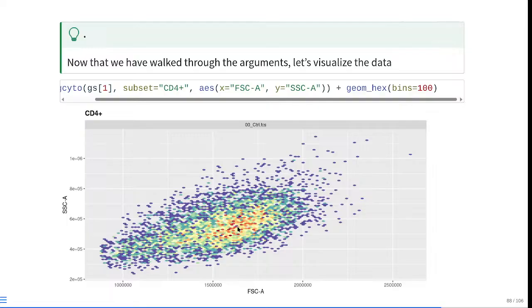And this will also impact the pseudo-color appearance of the heat map values that you see present in the plot. So this is something you can play around with until you get it to the right level of granularity that you actually want to show for a particular plot, a particular style.